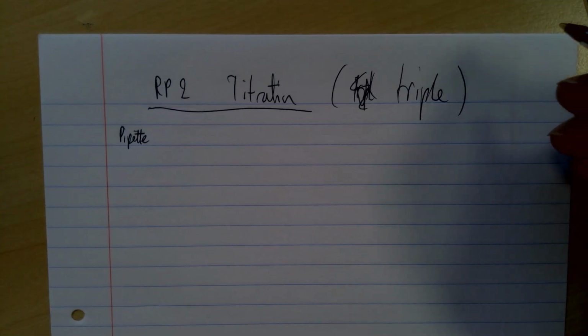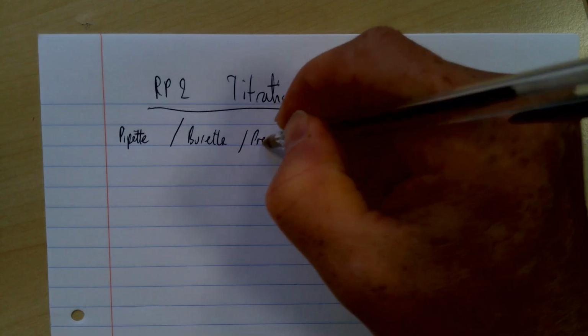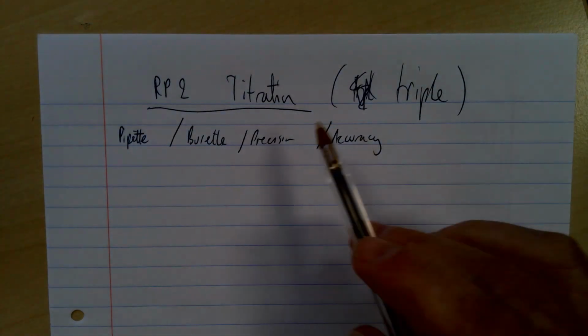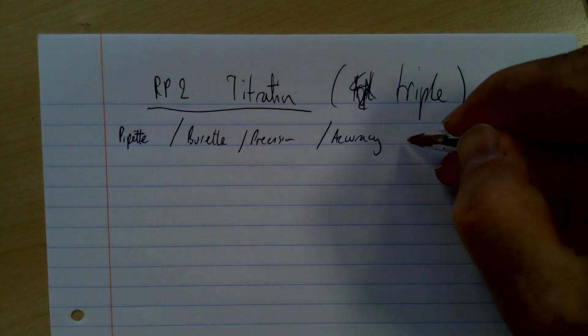So remember to use and write down all the kit you're using. Just remind yourself to look up, and again, you can have a look at it. There are some fantastic videos on this in detail on YouTube, which I've shared with you that aren't mine. So I'll encourage you to use those: pipette, burette, and talk about words like precision and accuracy. Precision, this idea that all the values will be about the same. So if a series of values are very precise, they'll be about the same as each other. Accuracy, in other words, they're giving the right value.